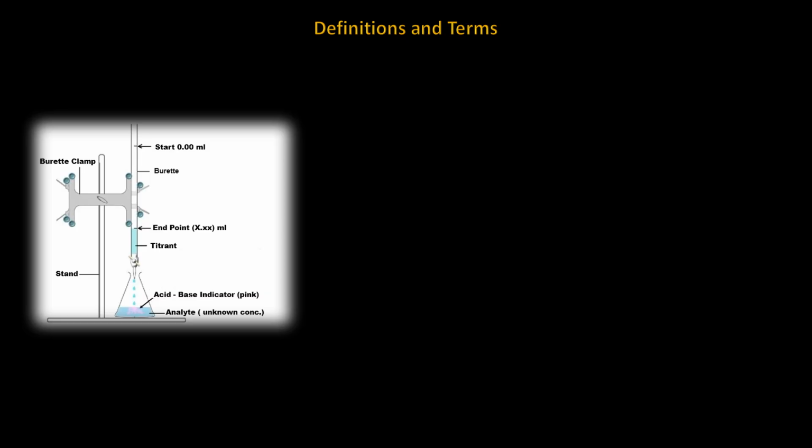Regarding the subject of titration, the terms used are sometimes misunderstood. The term titrant has been used many times in this presentation. It is the standard compound in a solution which has a known concentration that is used to titrate a sample. A titrant can be introduced by the use of a burette. However, it can at times be the solution in the beaker and the sample placed into the burette. The result would be the same. However, the indicator chosen may be different.